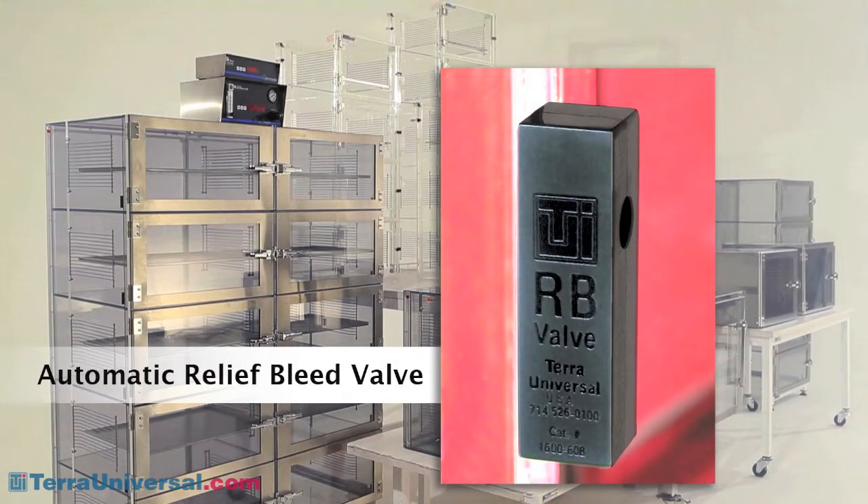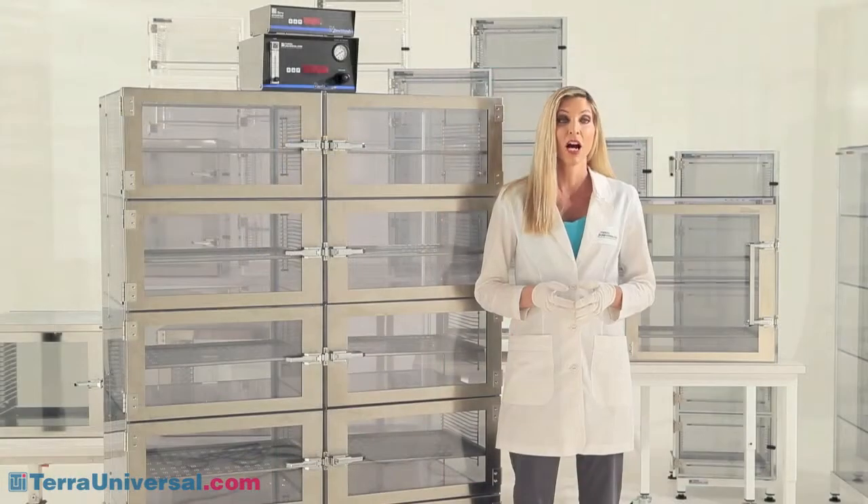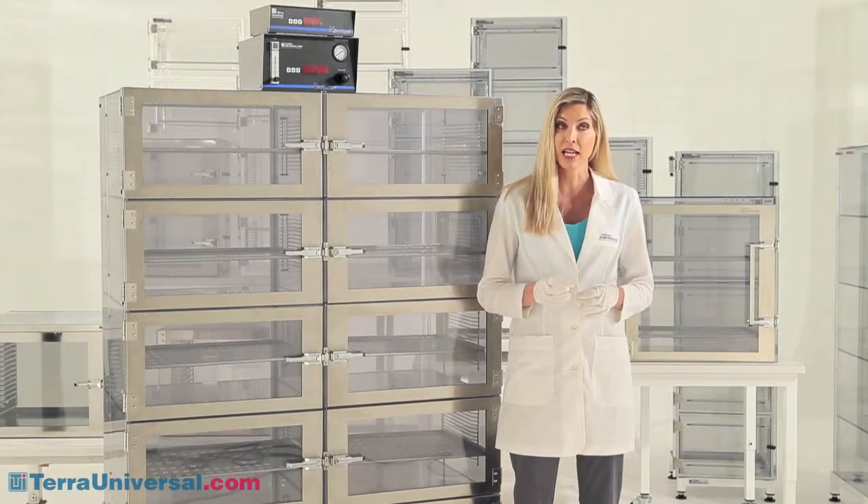Gas exits the cabinet through Terra's unique automatic RB valve. By installing one in each chamber, you ensure that moisture that enters when a door opens exits the same chamber without migrating throughout the cabinet. Adjust-A-Shelf desiccators can be configured with any of these controls to meet dry storage requirements down to 10% RH.